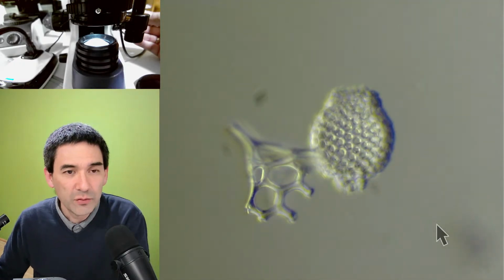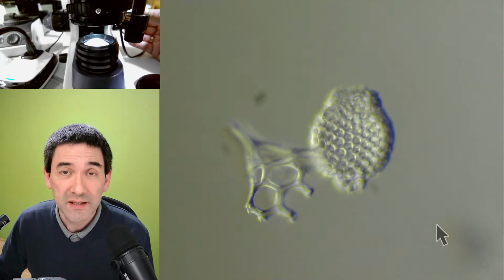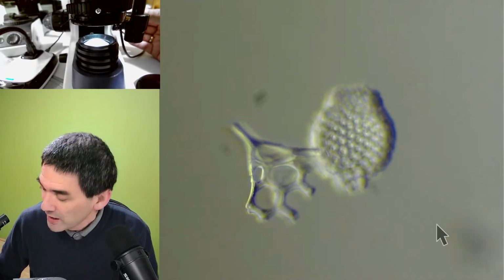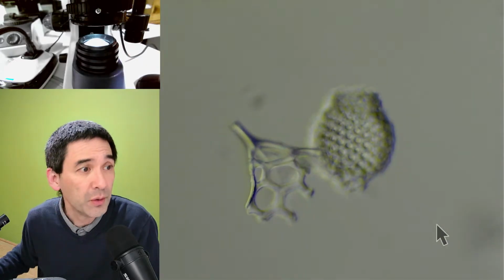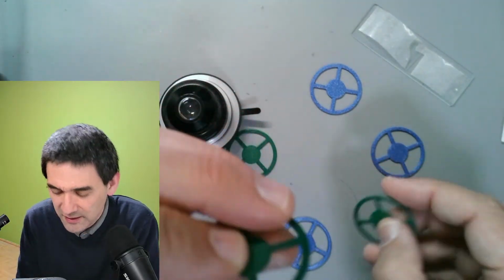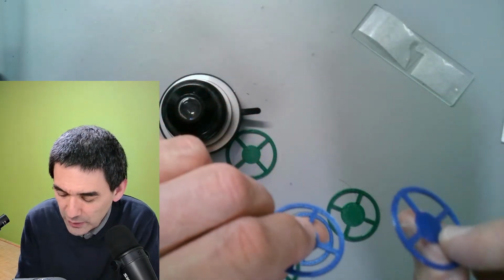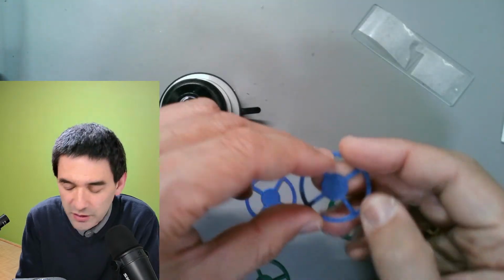So that's the radiolarians. I'm going to show you also a couple of my own cheek cells, which become much better visible using oblique illumination. But I want to show you the following, because we have also played around a little bit with some color. Just to show, with limited success, okay? Just for demonstration of what I also tried, I think it's this one over here, but there's not a huge difference.